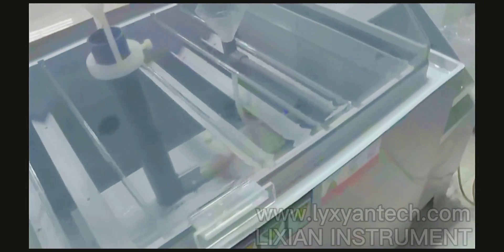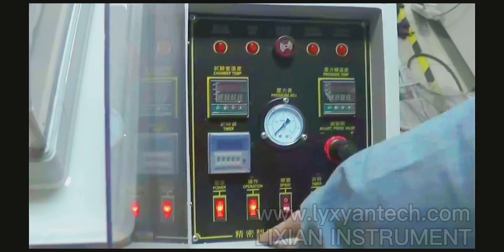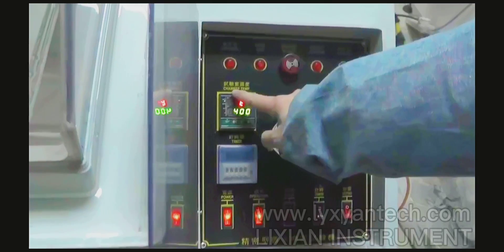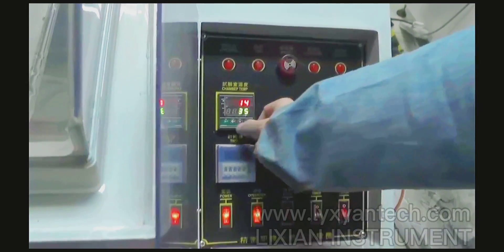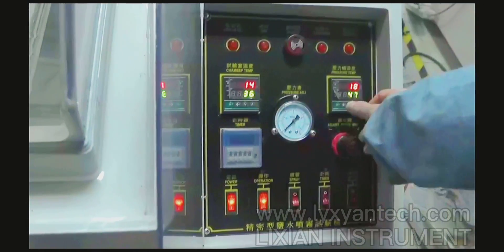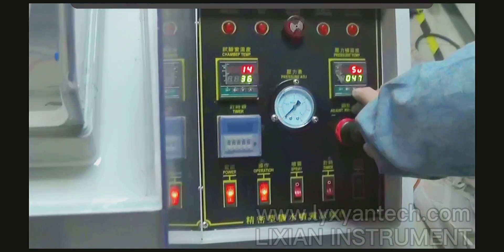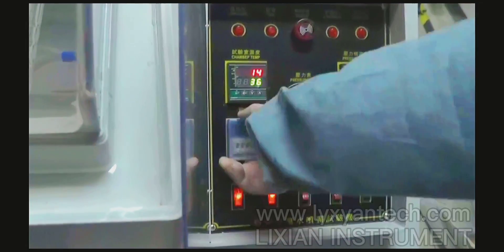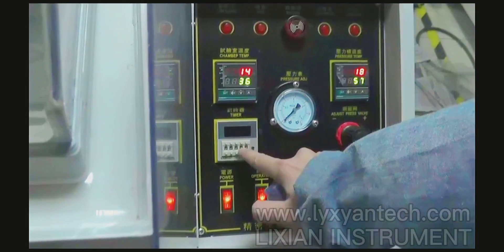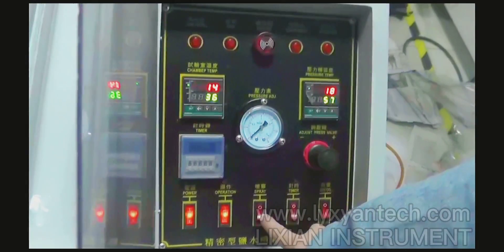Now we begin the test. First we open the power and then open the pump. We can see here — this is the testing chamber temperature, which we can set. This one is the pressure tank temperature, which we can also set. And this is the testing time setting. Now I set it to a certain number of seconds.